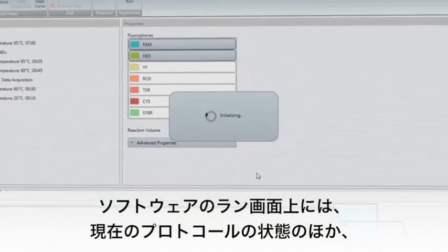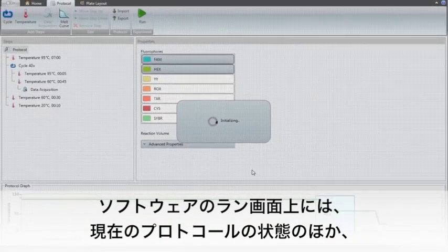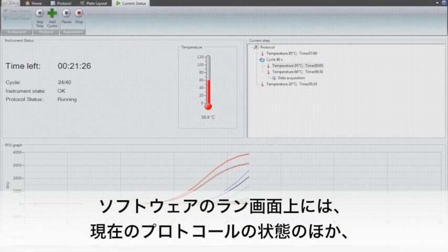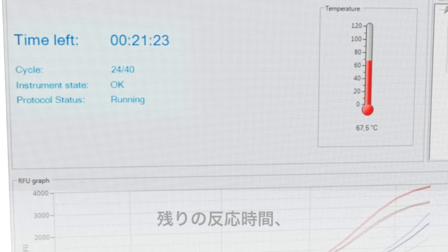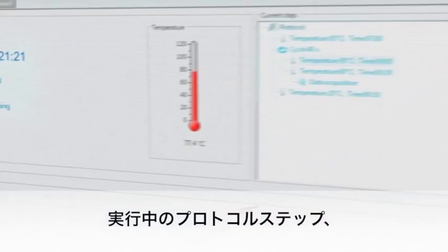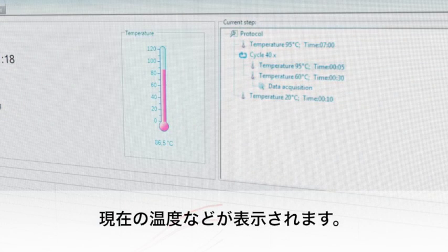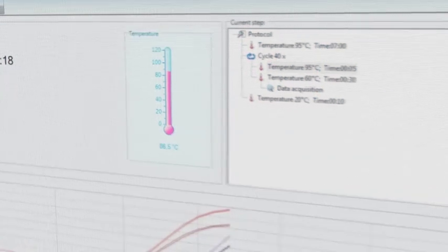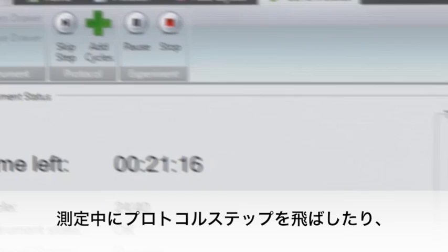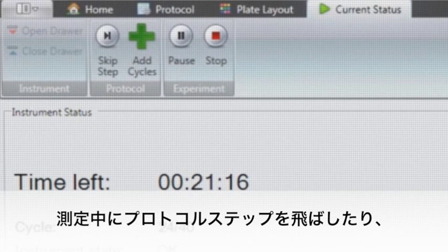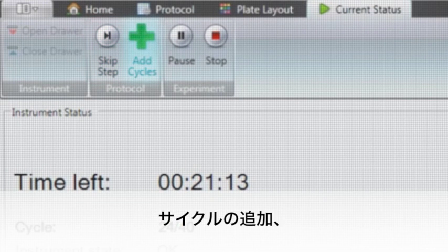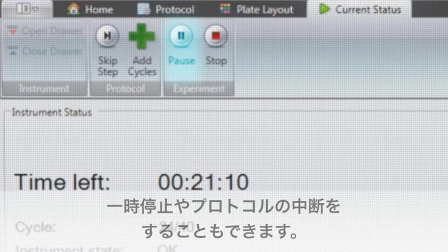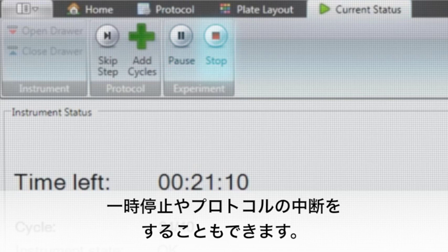Monitoring runs from the software run screen gives information on the current state of the protocol, remaining time, active protocol step, and current temperature. During the run, there is the possibility to skip a protocol step, add cycles, and pause or stop the protocol if required.